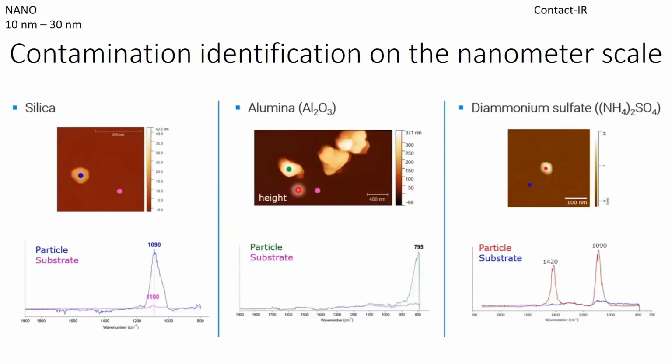And then the last idea to pitch here is that we have worked on several projects where we use this particular technique to help identify contaminants on the surface. IR, generally speaking, has greater sensitivity to organics, but we can also detect inorganics, as shown here on various substrates.